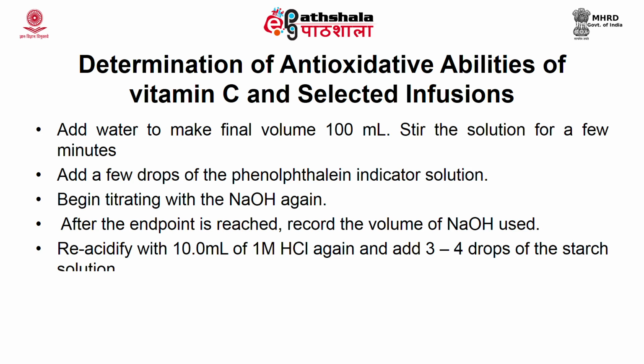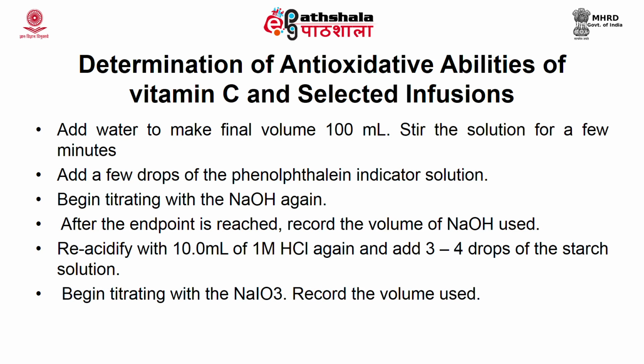Re-acidify with 10 ml of 1 molar HCl and add 3-4 drops of starch solution. Begin titrating with sodium iodate solution. Record the volume used. Repeat the above steps with other tablets to compare the antioxidative abilities of different tablets, and you can compare the values written on the tablet with the results.